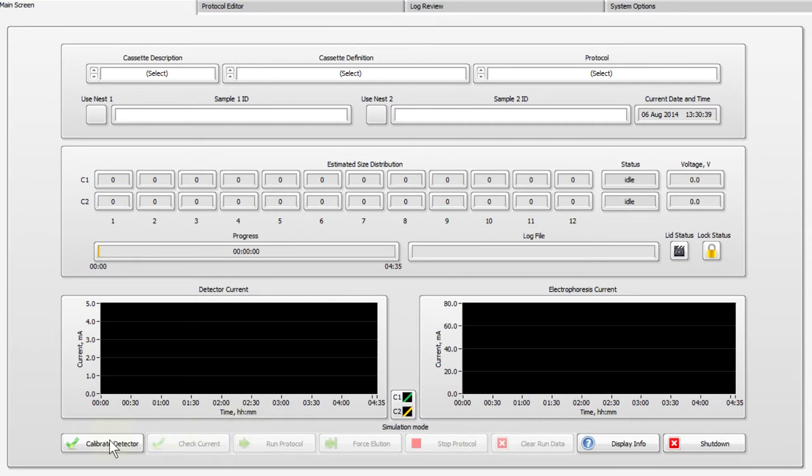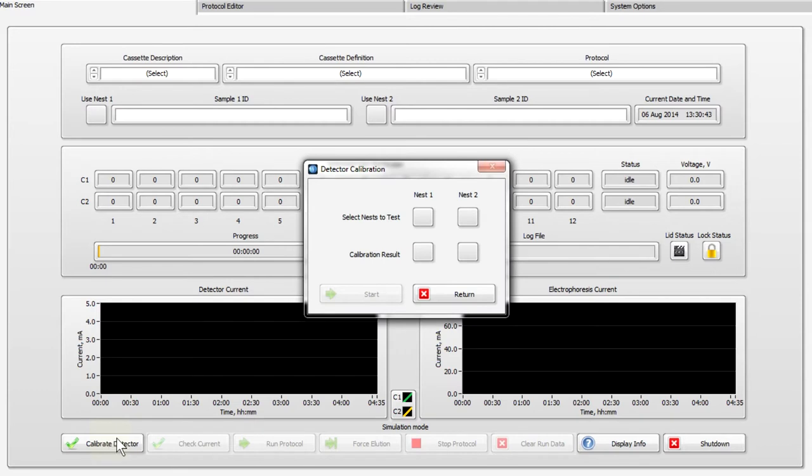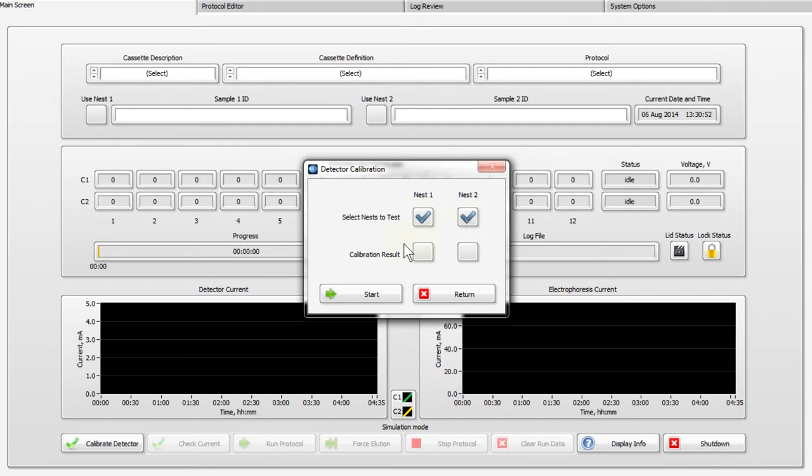A pop-up window will appear. Select the nest or nests that you wish to calibrate. Press Start.